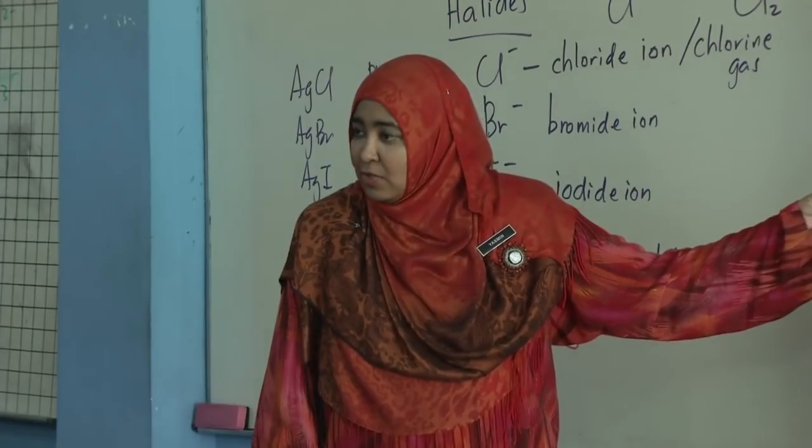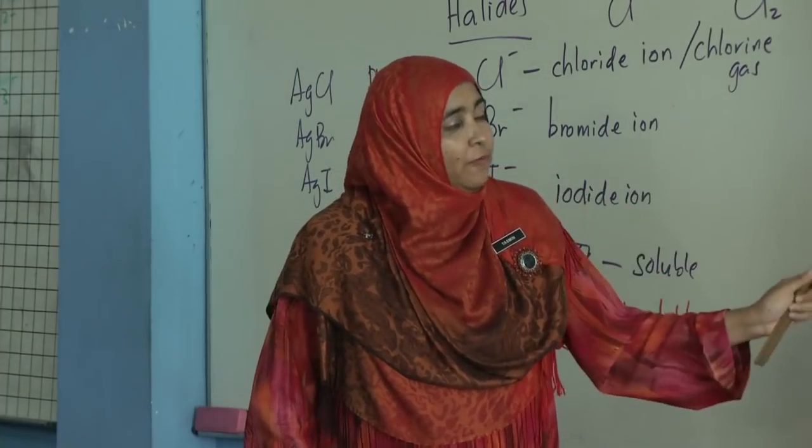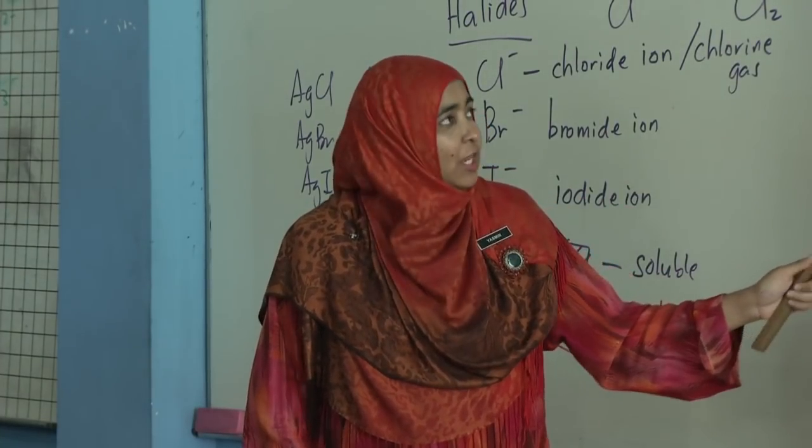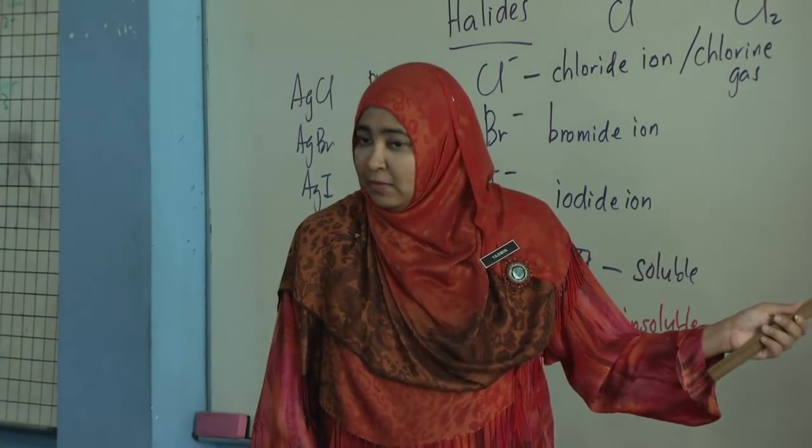What is the function of the glass rod? Is it to stir? No, you stir before. Now, you're using it to avoid spillage, because we don't want the salt solution to spill over from the filter funnel. Okay, until here, clear? Yes.